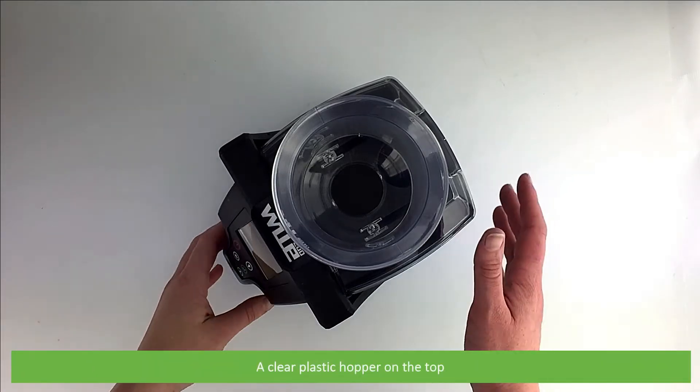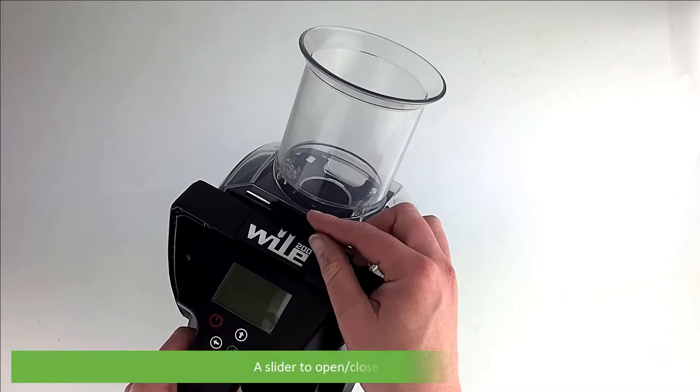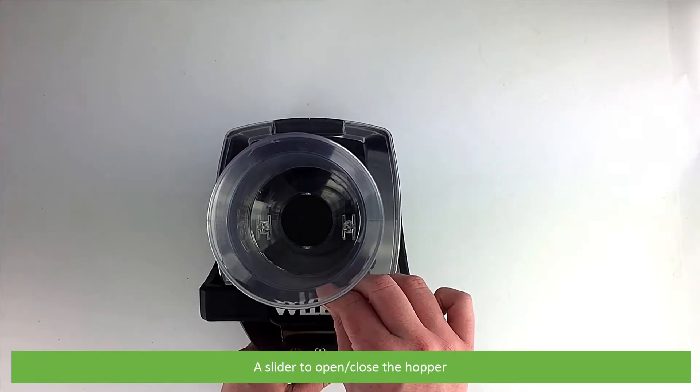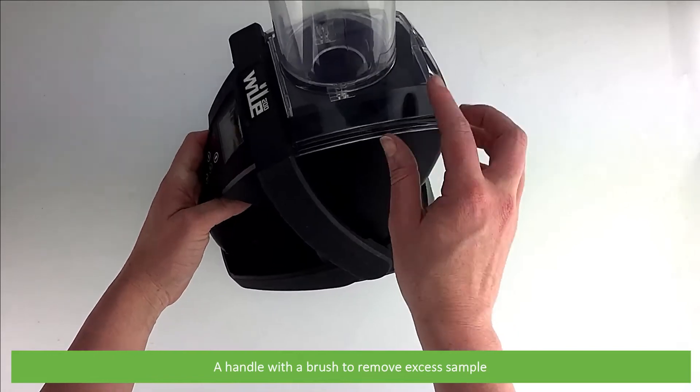Features of this meter include a clear plastic hopper on the top, a slider to open and close the hopper, and a handle with a brush to remove excess sample.